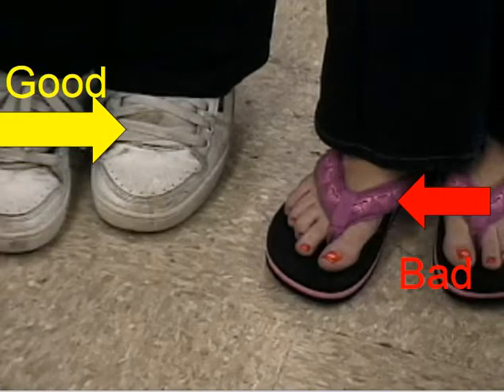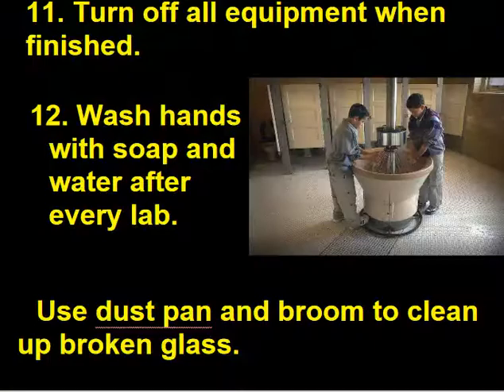The reason why we don't want you to wear sandals is because if a hot liquid spills, it's going to go right down the apron. It's going to go where? Right to your feet, and your feet are going to be burned. Or if it's an acid, your feet are going to be burned by the acids. Now, a regular shoe you can usually take off pretty quickly before it gets to your toes. But if you have an open-toed shoe, wow, it's going to burn right away.